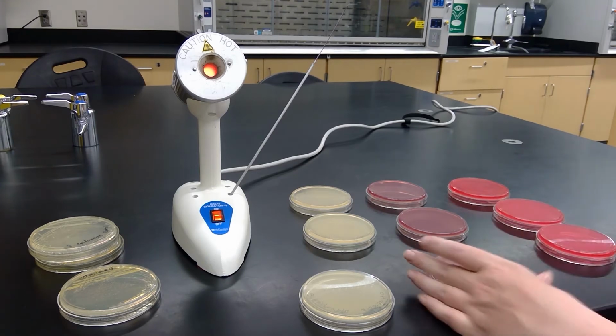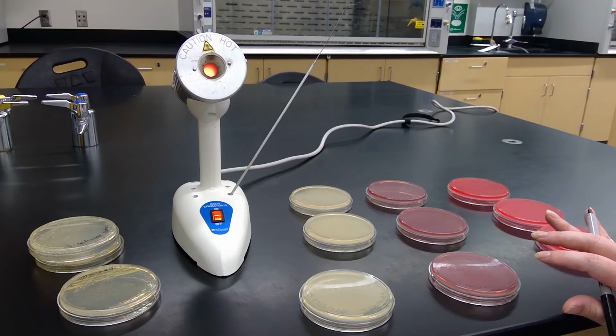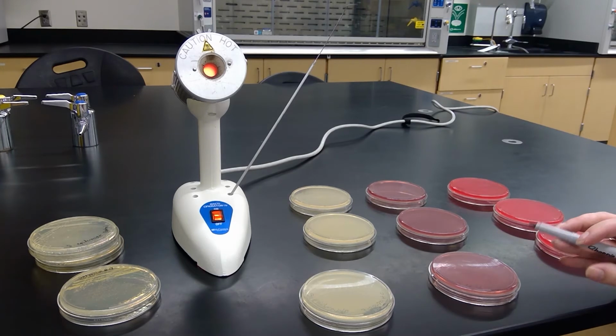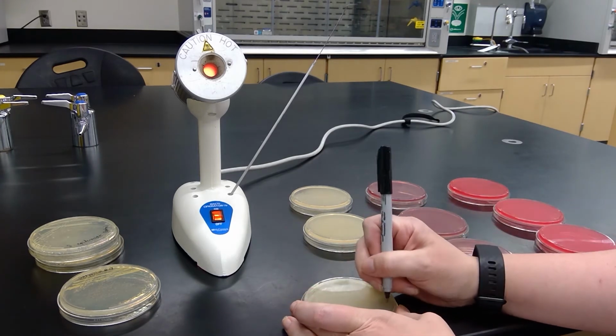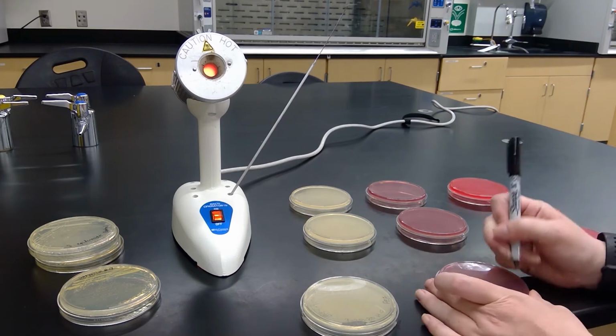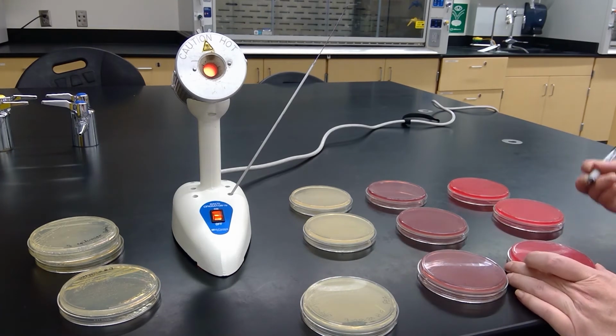And then your initials. But I just realized, this is the first time we're using a different media than TSA. So you also want to write what media you're using. So this one's PEA, this one's MAC, and this one is MSA.